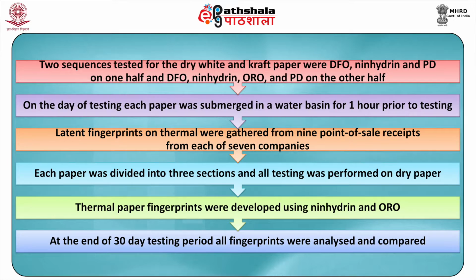The two sequences tested for the dry white and craft paper were DFO, ninhydrin, and physical developer on one half and DFO, ninhydrin, ORO, and physical developer on the other half. The wet papers used the same two sequences except that on the day of testing, each paper was submerged in a water basin for 1 hour prior to testing.